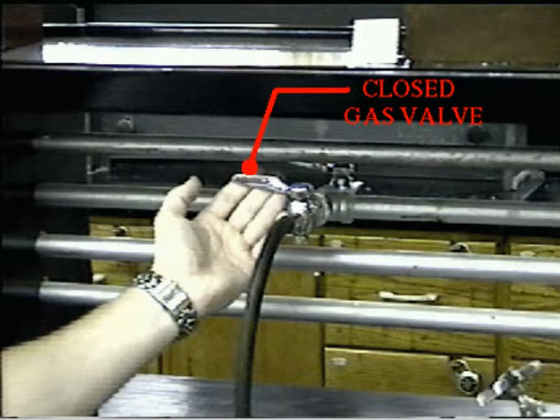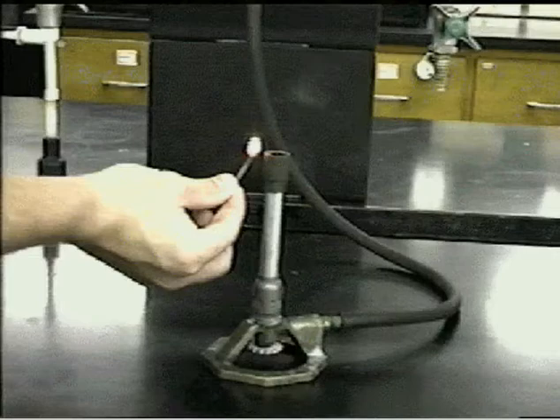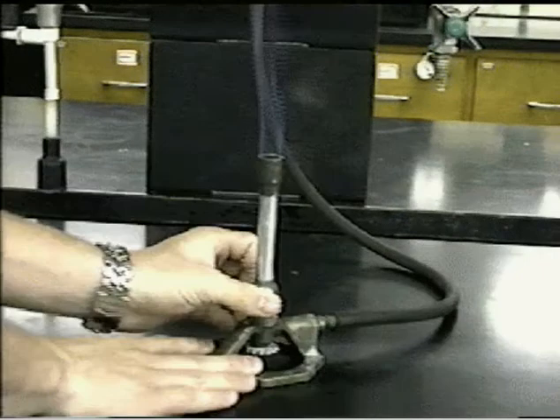So the valves that you see, those are not water. A lot of students will mistake those for water at the sinks. Those are actually the gas valves. If it forms a 90-degree angle with the hose, it's closed. But if you have it going straight out, pointing towards the nozzle of the hose, that means it's open. And then again, hold your hand off to the side of the Bunsen burner.